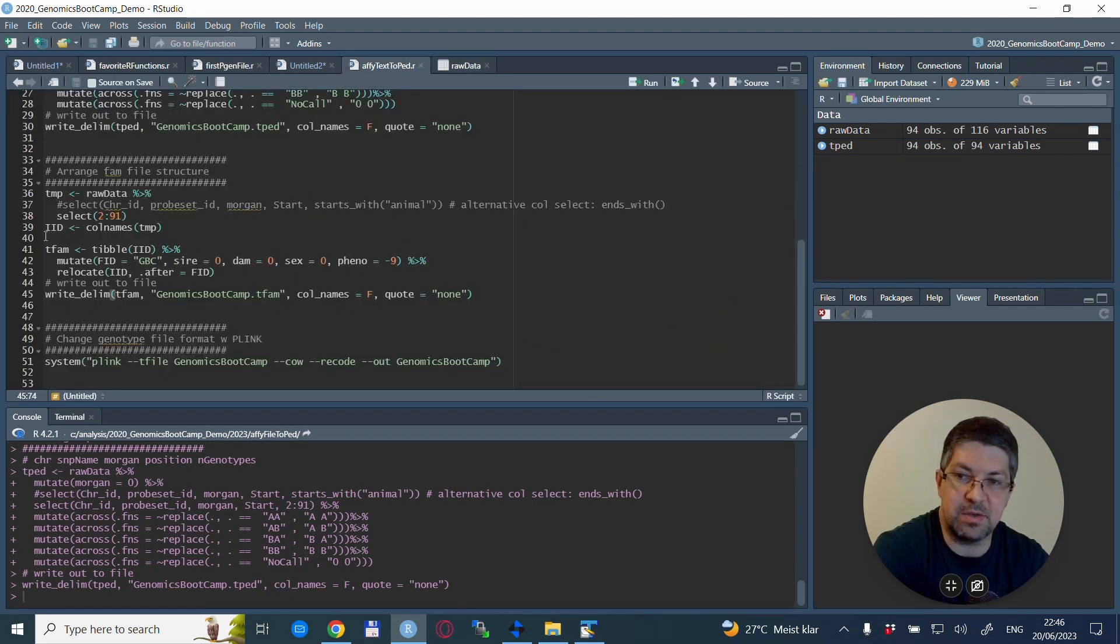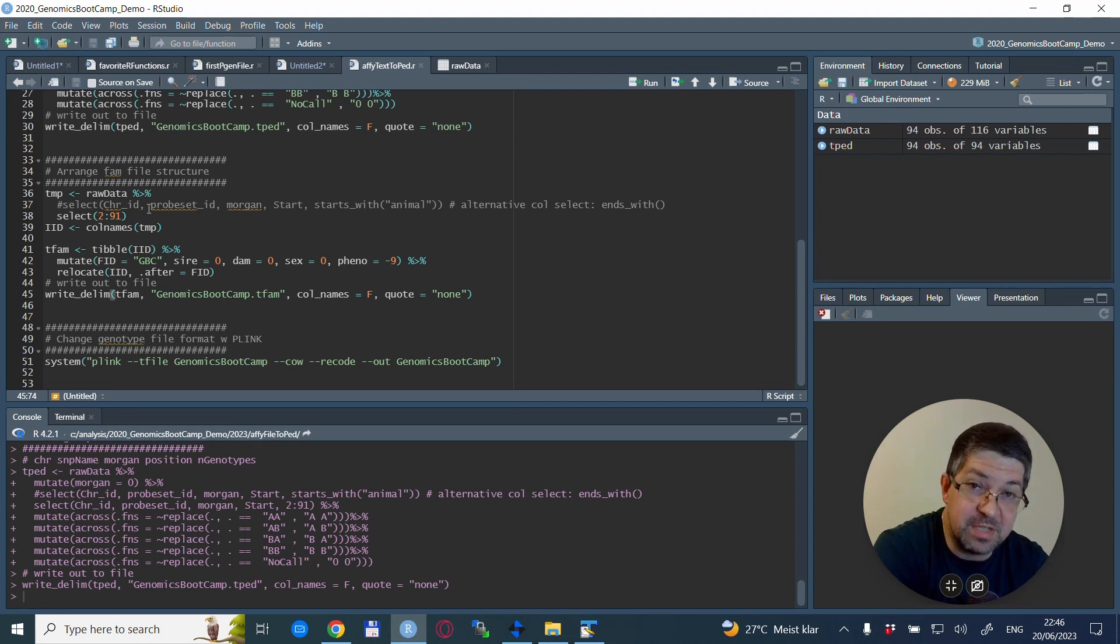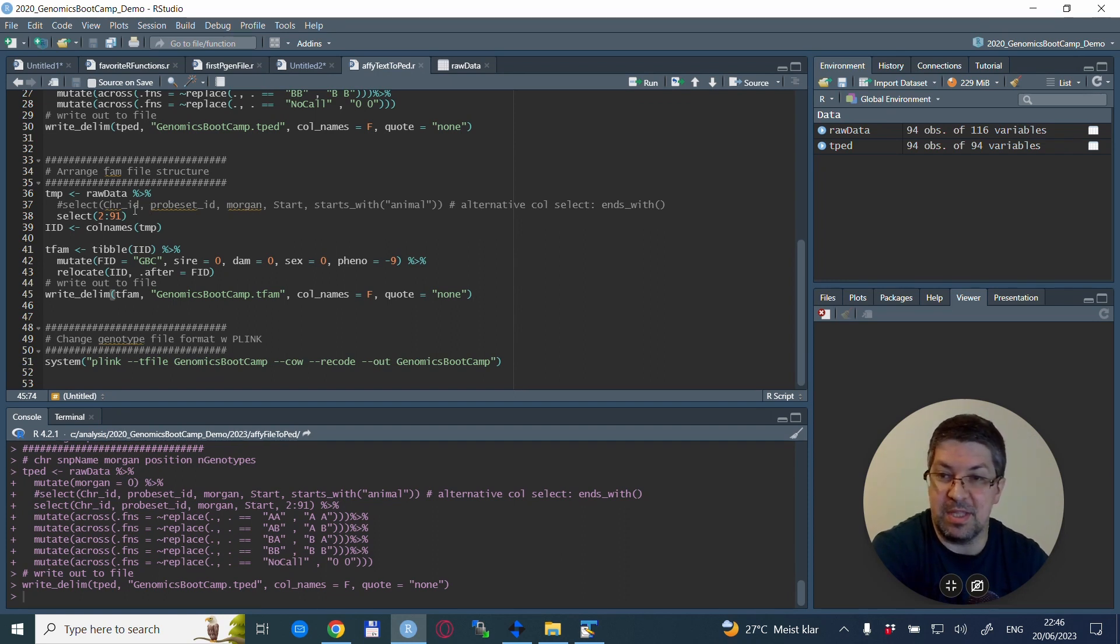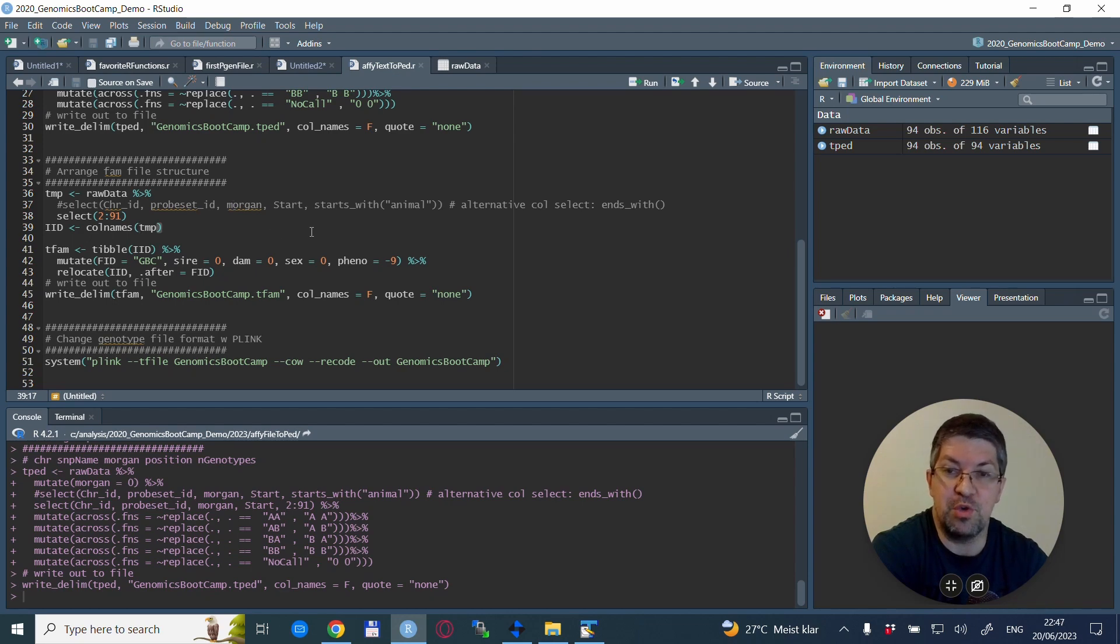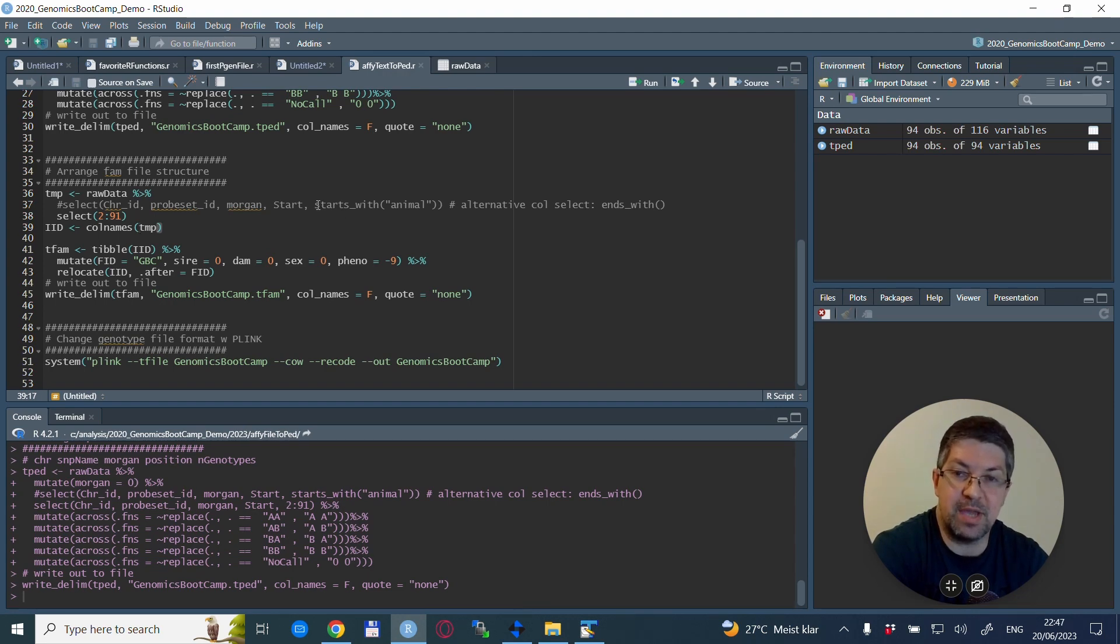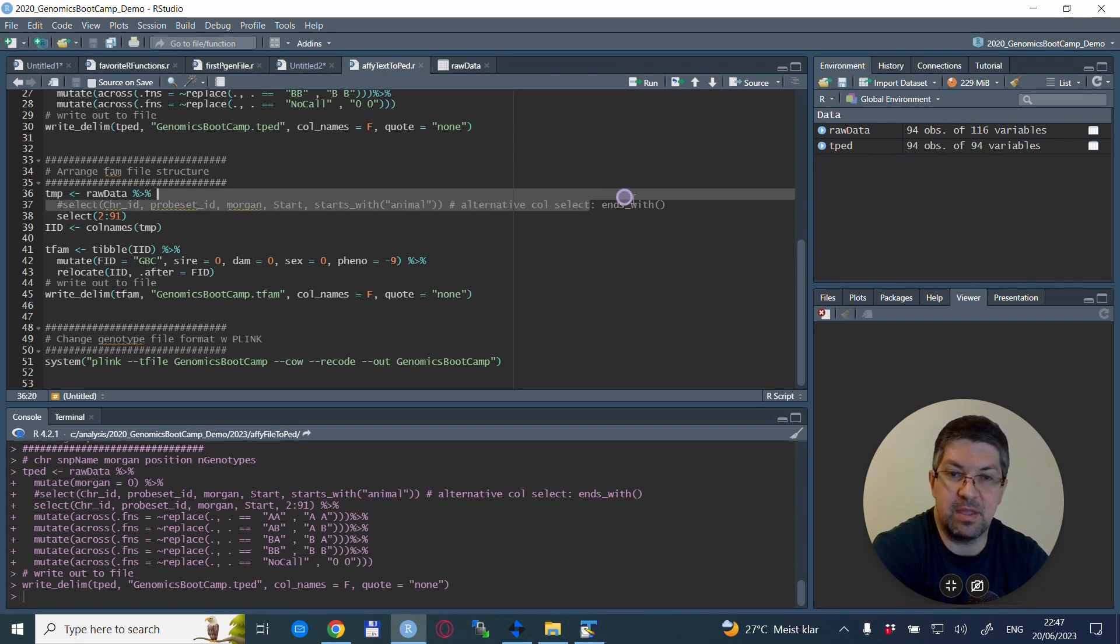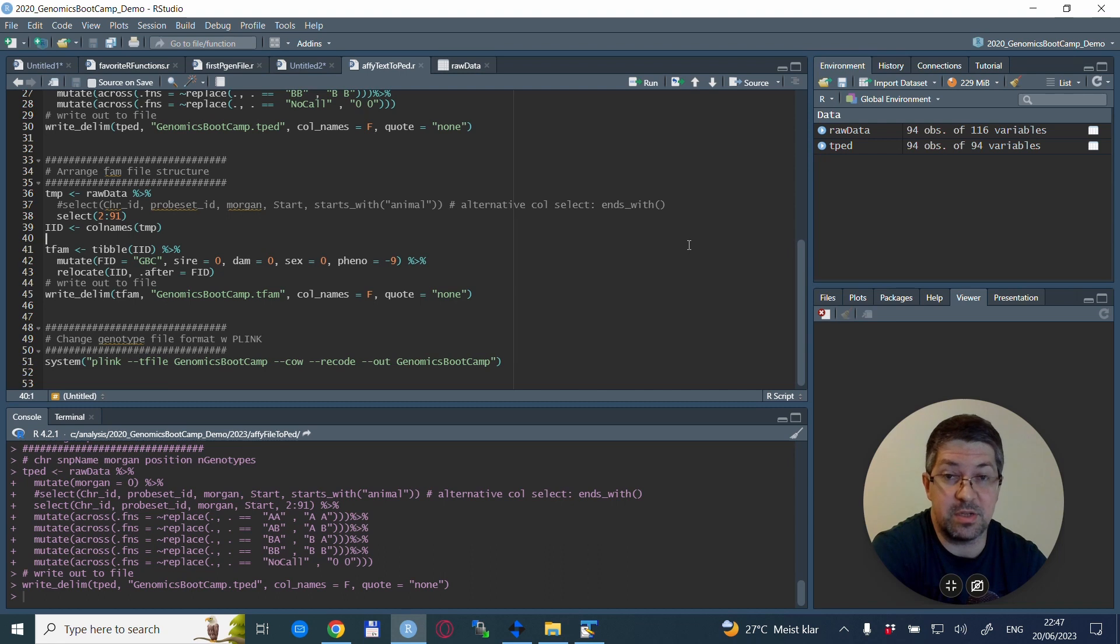Again, if you read the manual on the plink webpage, it will say that it requires one more file—that is the so-called tfam file, which is basically just a fam file. So it's very much the same, but it's called tfam in this case. For this, the most important thing is the individual ID that is saved in the column names for this file.